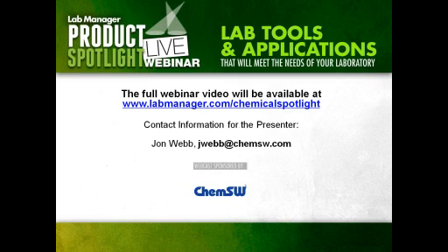Okay. And then, since we've talked about MSDSs so much, you recommended that people go out and do their own research if there is something that doesn't have one associated with it. So do you have any sort of guidance in terms of how you go about developing your own MSDS system using either the tracking software or something else?